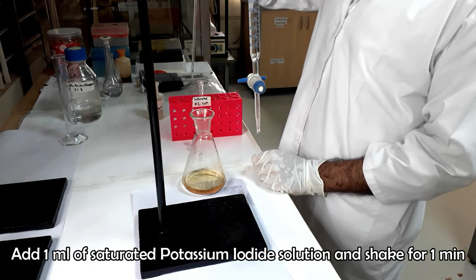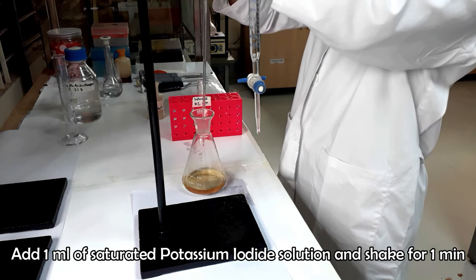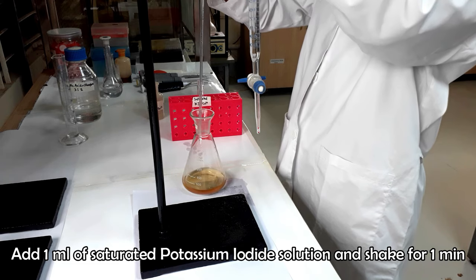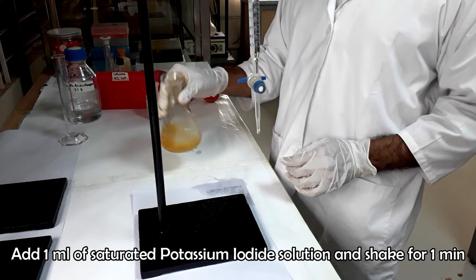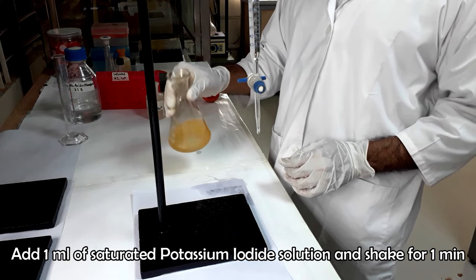Now, add 1 ml saturated potassium iodide in the same flask. Shake and rotate the flask clockwise and anticlockwise for 1 minute to make a homogeneous mixture.